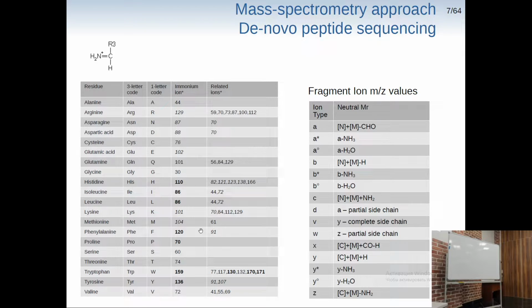For instance, an ion trap will lose some of them, an orbitrap mostly will lose all of them. So those small masses will be mostly accessible in time of flight mass spectrometry, which can be one of the benefits of using them.